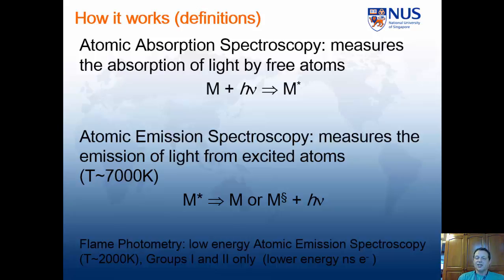You might recall Planck's law, E equals h nu. And it's that light which is measured, and that light which forms the basis of the concentration measurement of any metal. Because these metal atoms are effectively all excited all the time, you're just measuring the emission, not the absorption.